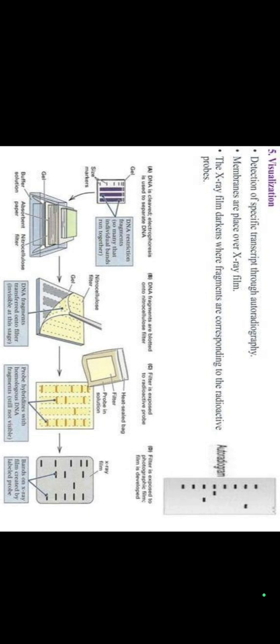Visualization: detection of specific transcript through autoradiography, where the membrane is placed over X-ray film. The X-ray film darkens where fragments correspond to the radioactive probes.